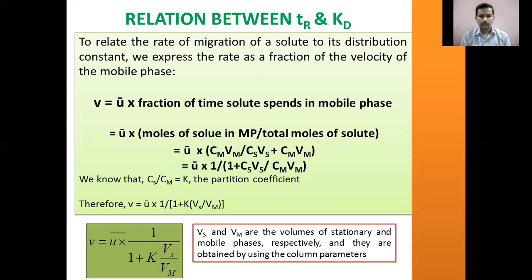You have understood in our previous module that from the chromatogram we will be able to obtain the identity of the solute and the concentration of the solute present in the sample solution. These are usually obtained by the relative positioning of the chromatographic peak in the chromatogram and the height of the chromatographic peak. So we can certainly obtain the identity and the concentration.